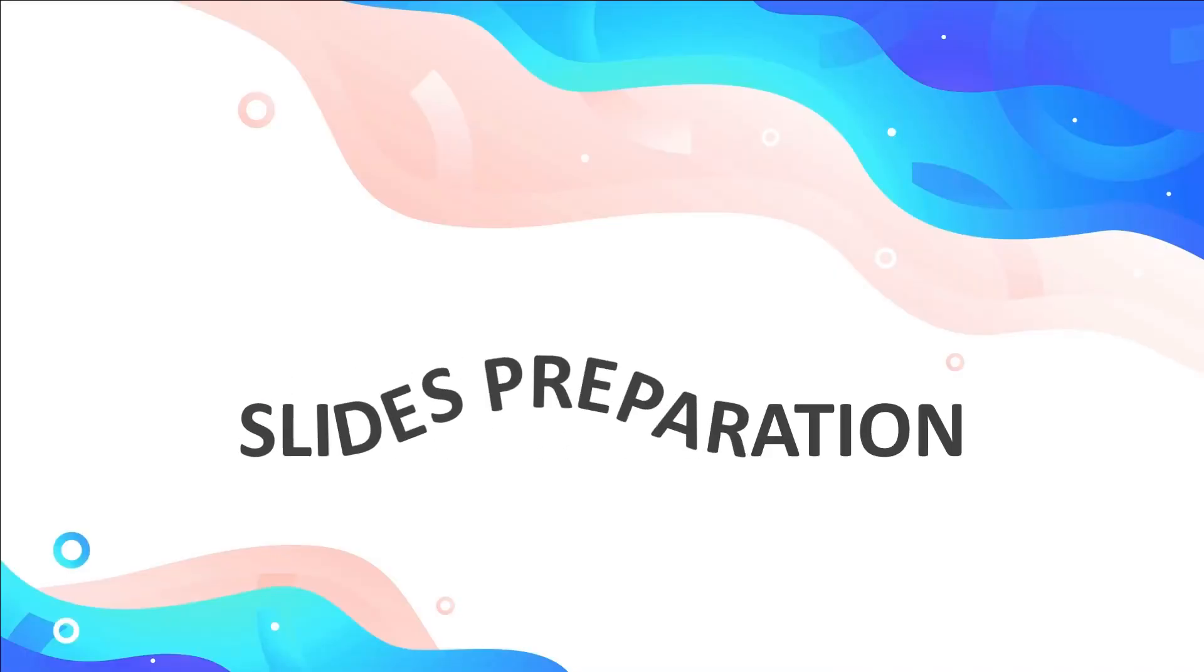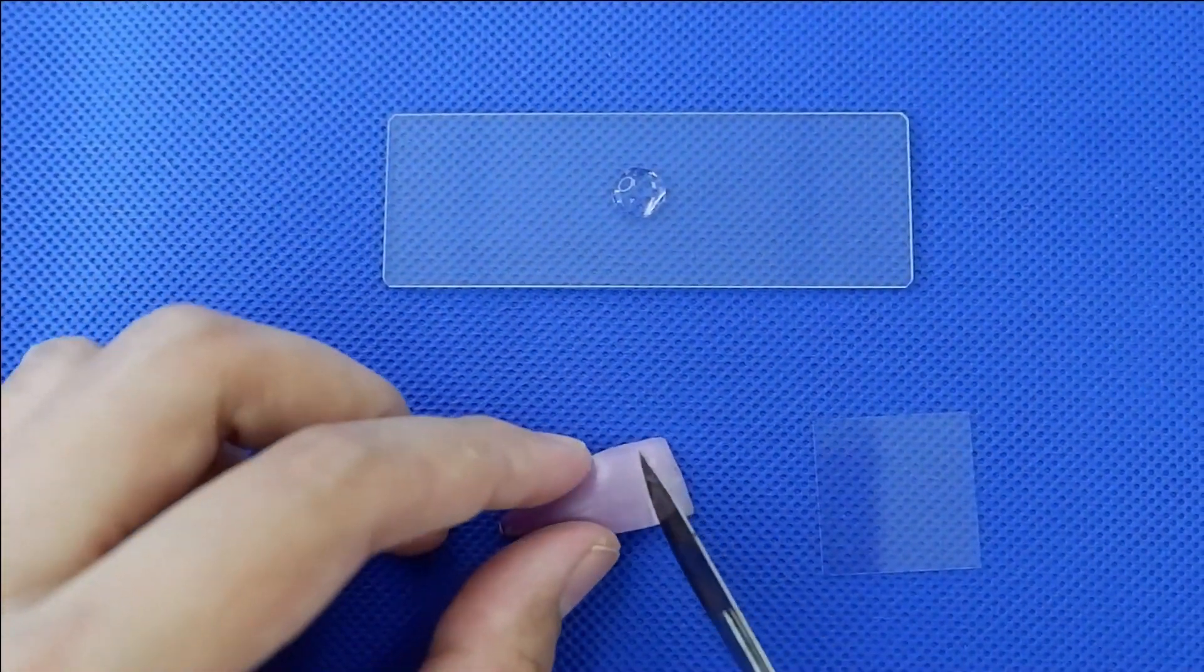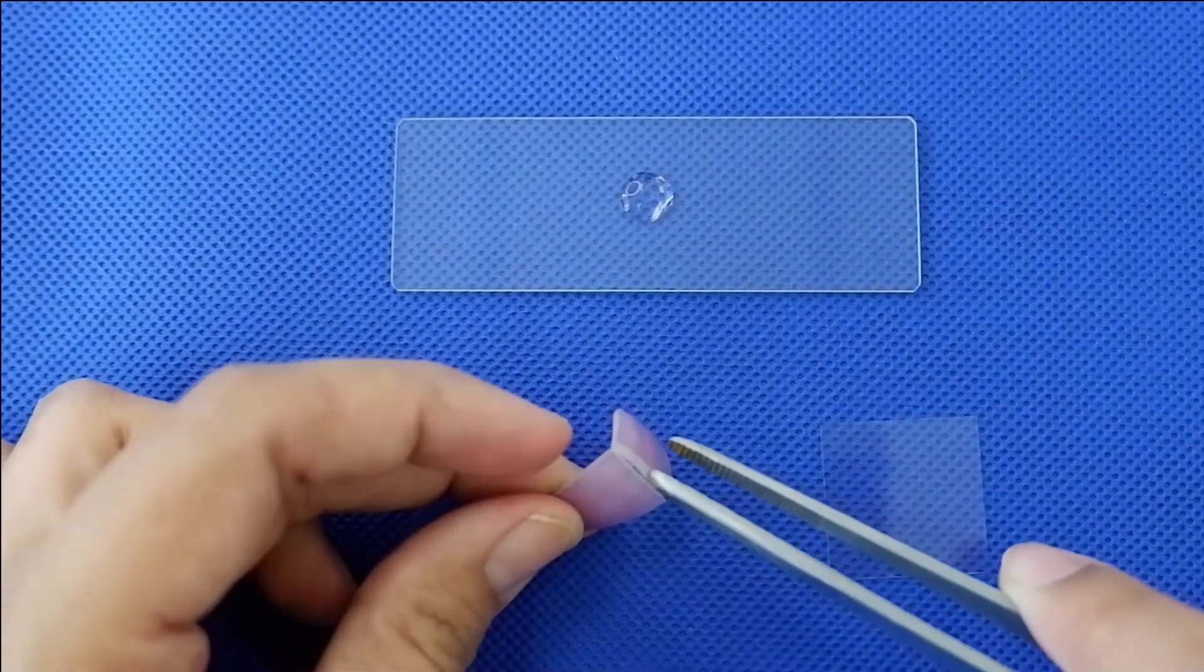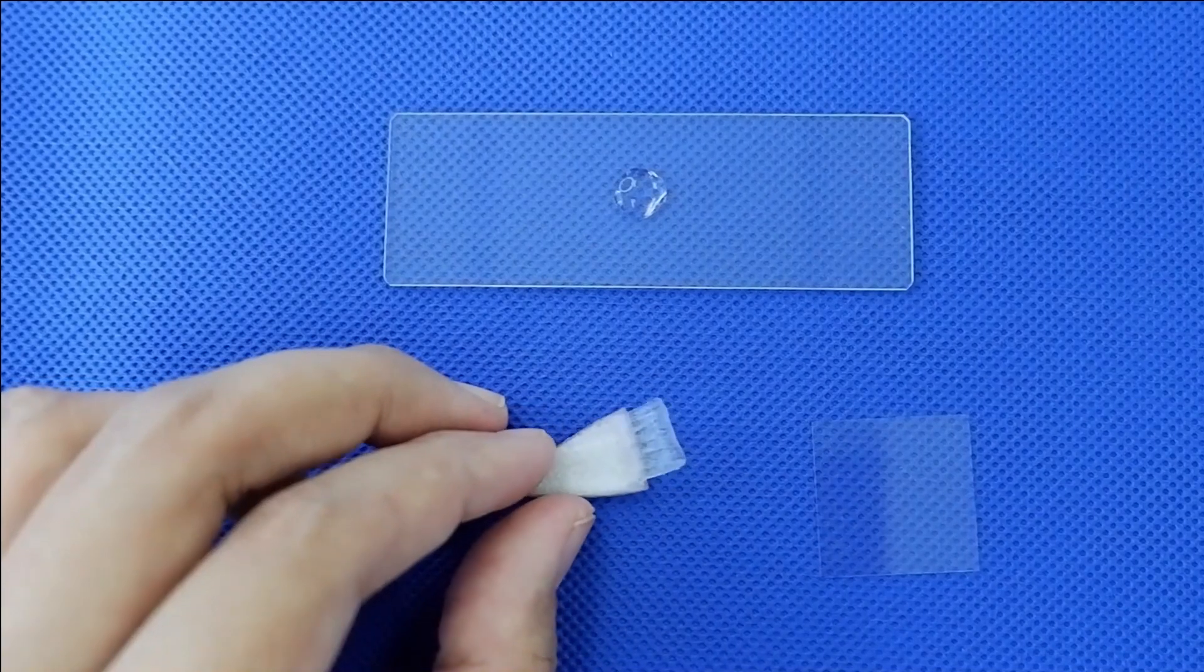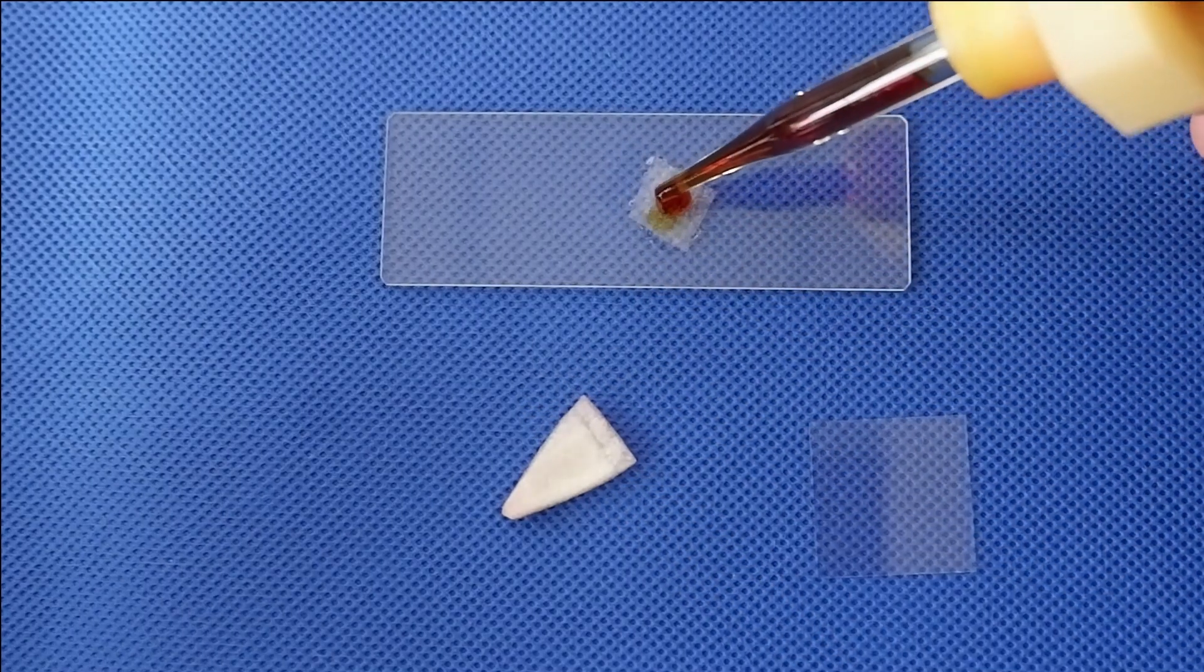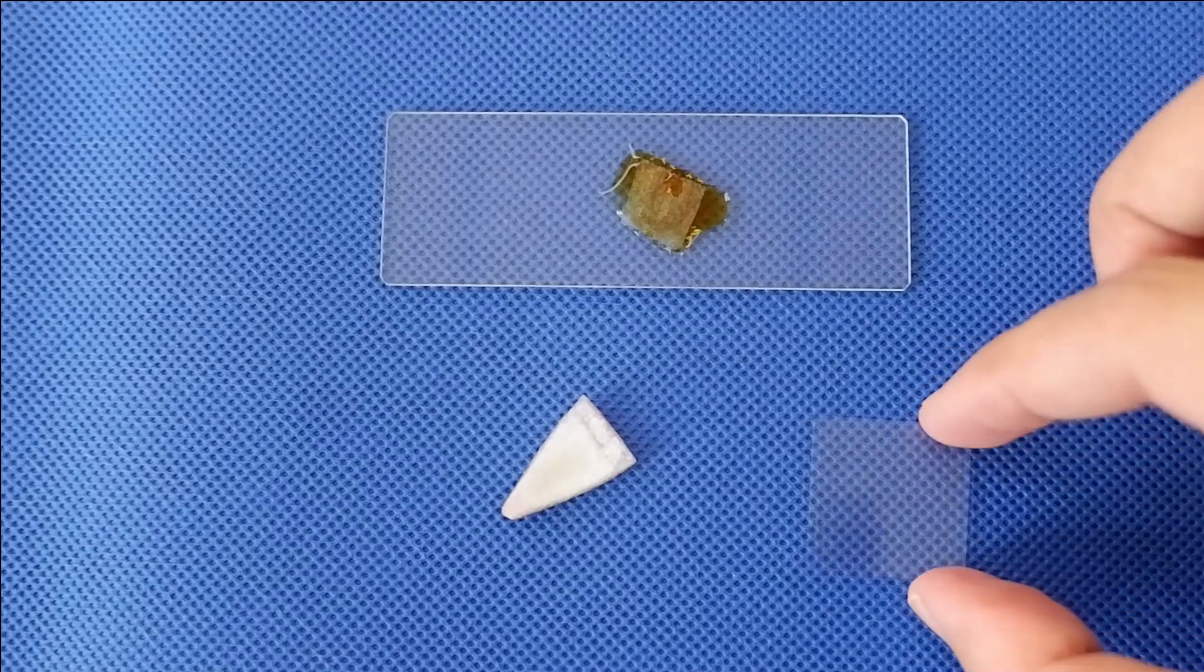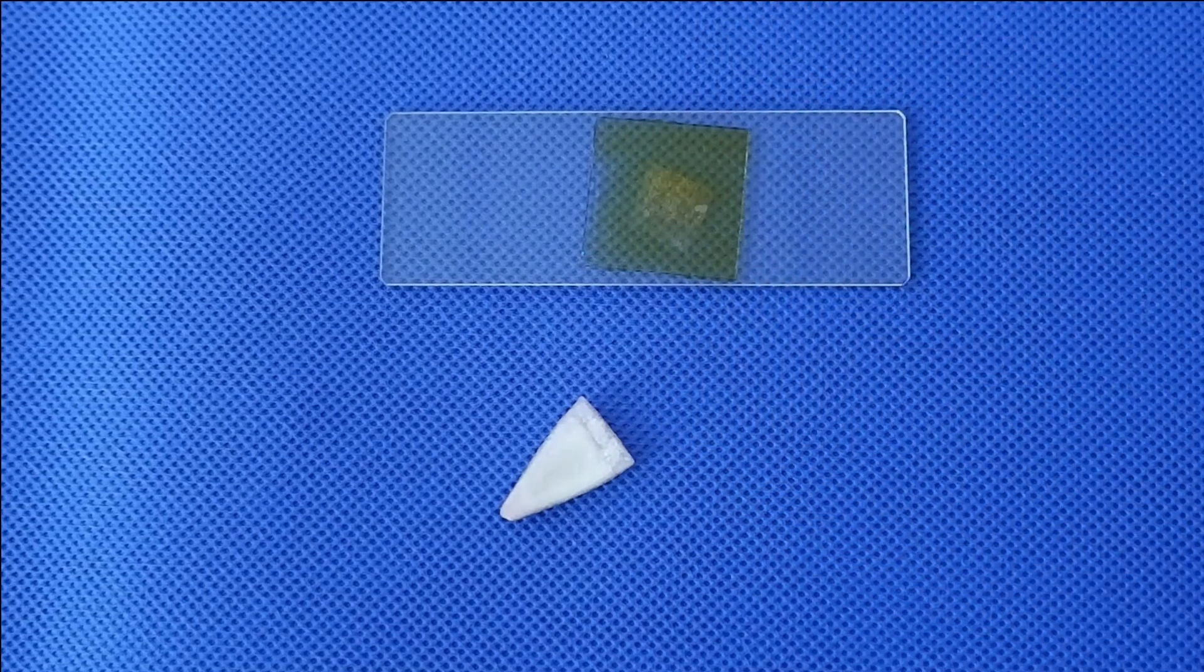Now let's start preparing the slides. For plant cells, we are going to use onion epidermis and iodine as staining. Cut a small section of an onion using a scalpel. Use forceps to remove the cutting and carefully peel off the thin transparent epidermis. Transfer the epidermis to the center of microscope slide. Then put a drop of iodine stain on the epidermis. This is a wet mount. Place one edge of cover slip to one side of stain and slowly lower the cover slip. If you need to remove excess stain, touch the edge of slip with paper towel.